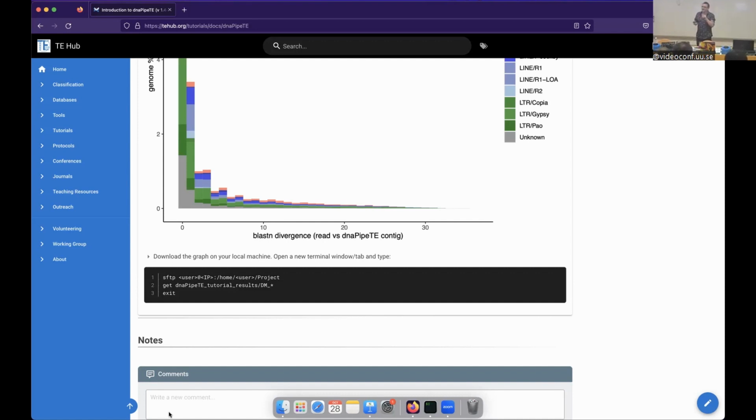Yes, that's the thing, exactly, because you are looking at proportions and you try to estimate the proportion of repeats. The more reads, the more it's repeated, so the more it's in the genome. And in RNA-seq, the more it's expressed. So I think you should try, or we should try, and see what happens. Technically, it can take it. Sorry, I cannot be more precise.